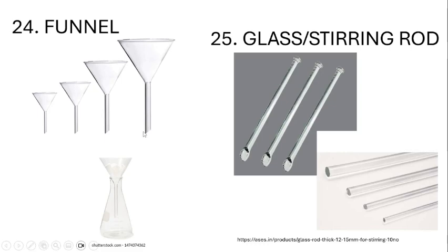So it is used together with a filter paper as shown in this illustration, and then the funnel is placed on top of an Erlenmeyer flask. Then in filtration, you pour your solution and then the filtrate will pass through the narrow tube and the residue will be retained on the filter paper.